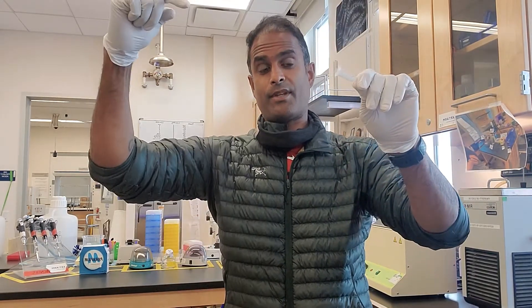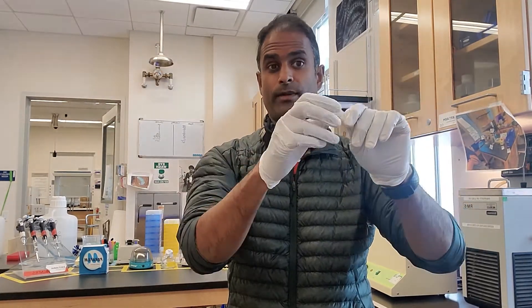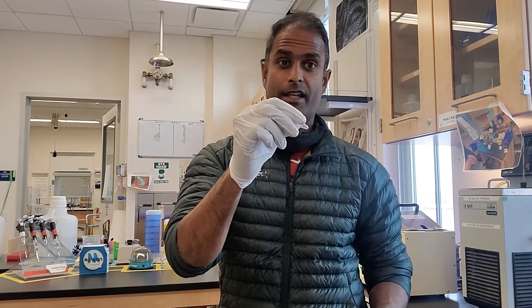Hi everybody, this is going to be a quick tutorial on how to use a centrifuge. You're going to be using a centrifuge for the S&P project to spin down things through a column. Your column is going to be placed in one of these tubes, it's going to have a solution in it, this thing is going to spin, hold the tube slightly to the side, and because of the spinning, the liquid is going to be forced through the tube and come out on the bottom end.